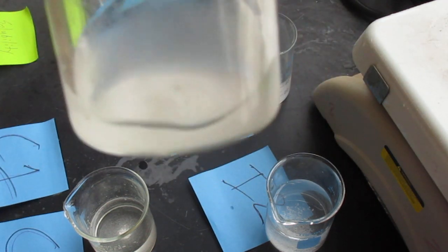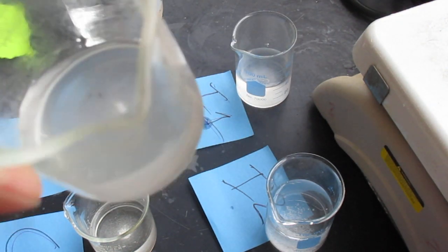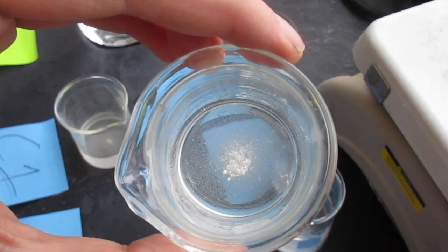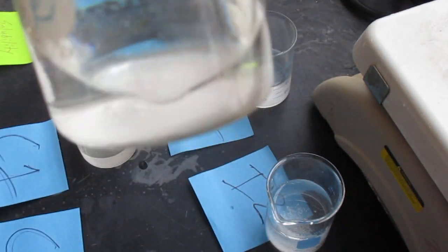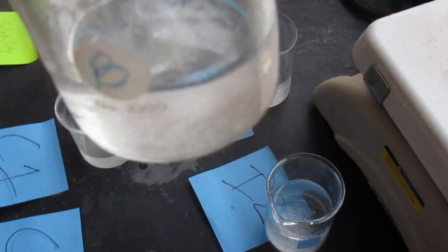This kind of has a milkiness to it, it's not as clear, which is a sign that it didn't dissolve. And this one you can actually see all the big chunks still. You can see that it is cloudy as well.